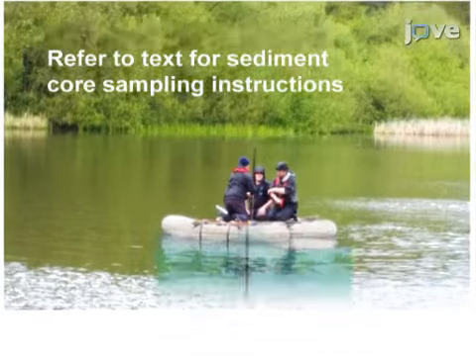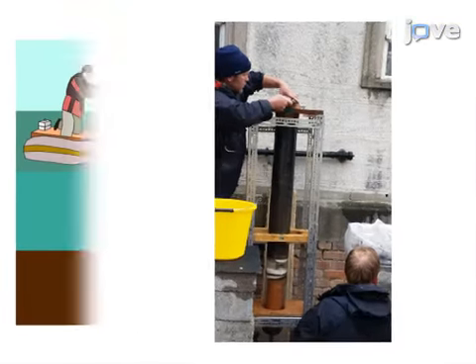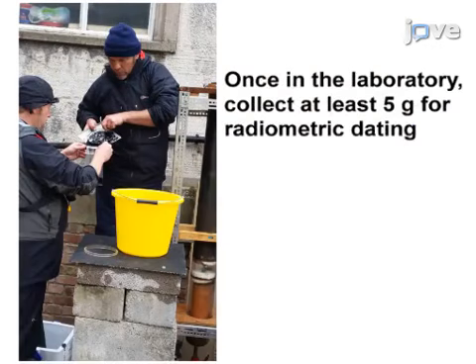After obtaining a core tube of sample sediment from a lake or pond, use a flat metal tool to slice the core into horizontal 1 cm layers. Then, collect the sediment layers in separate bags.